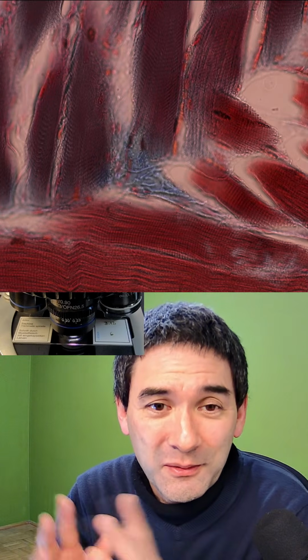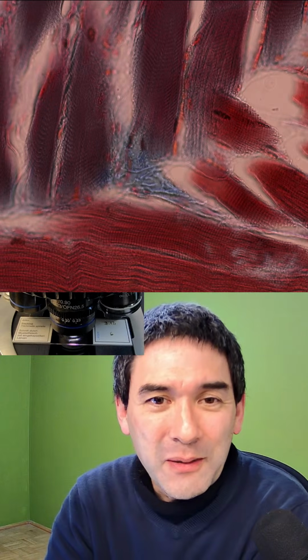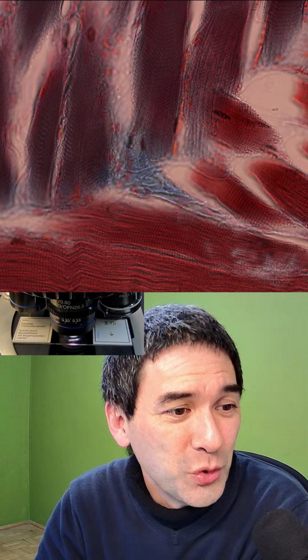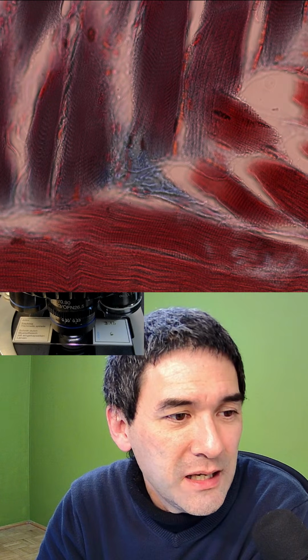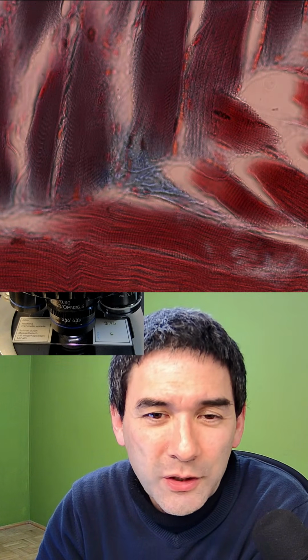And because somebody wanted to know a little bit of biology, one of the things that the early microscopists realized is they have seen those striations. Of course, they didn't know what it is. I can just show them to you, those striations, if you look very carefully. I have to now get the arrow moving, right? You see that there are those little stripes going across here, and also over here.